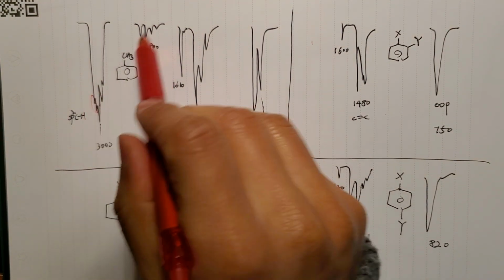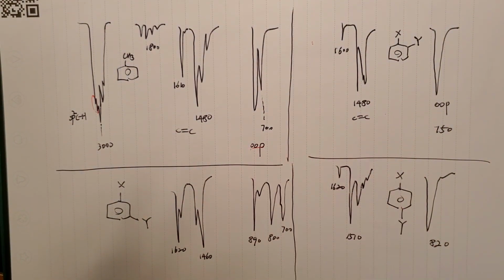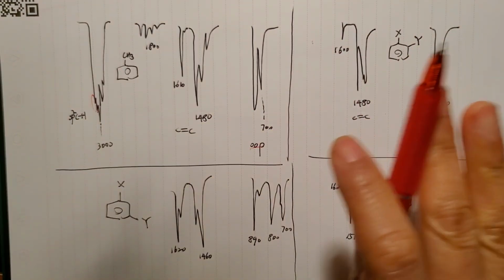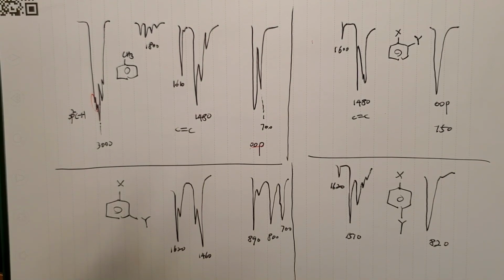So these are the common things, okay? The different things happening at this double bond area and the bending vibration out of plane area, okay, below 900 something, so below 1000 basically. And they're not weak or medium size, they're all intense.